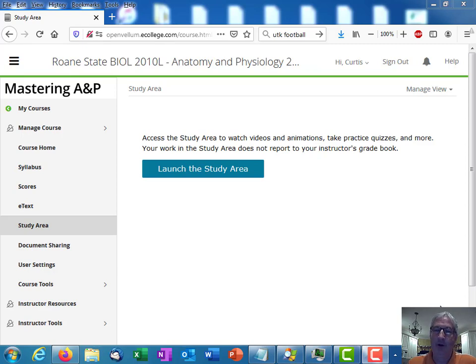Hey everybody, just want to do a quick video to take you through the Practice Anatomy Lab portion of Pearson. I want to show you some slides that are there that will fit in with the intro to skeletal system that we're doing. These are just the histology section.